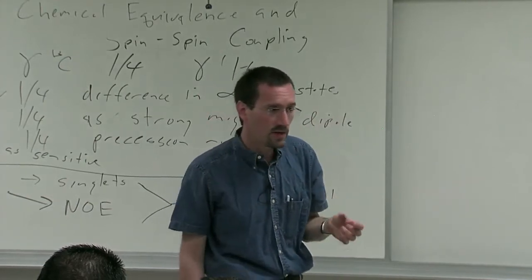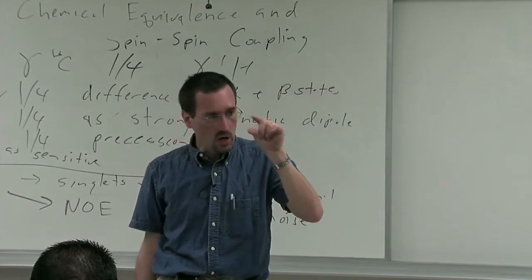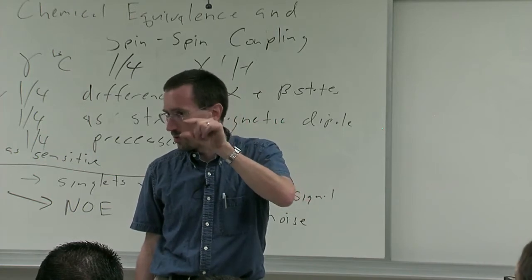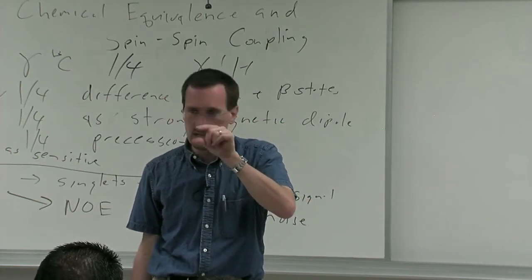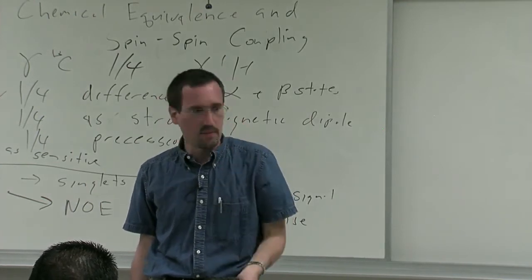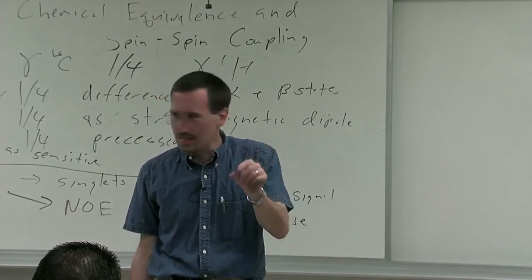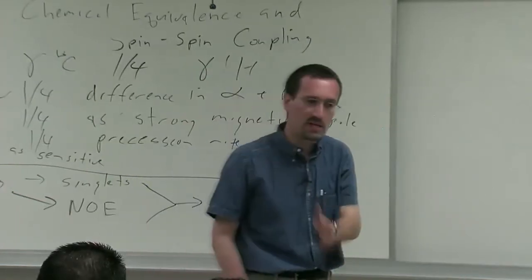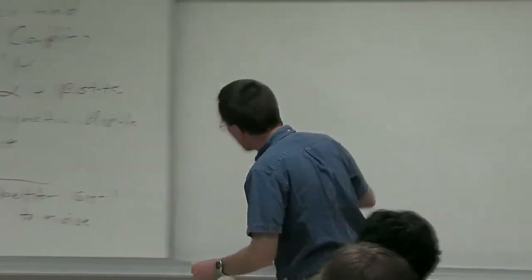It also makes sense when you're filling your NMR tube to fill it only with the appropriate amount for the coil. The coil on our Brukers requires a 3.5 centimeter high sample. That's about 0.5 mL. So if you dissolve your sample, don't dissolve it in 1.5 mL. Don't try to be clever and dissolve it in 0.3 mL either, because then you mess up the shims on the spectrum, since you get flux lines at the end of the sample. So anyway, that's the way to get a good spectrum.